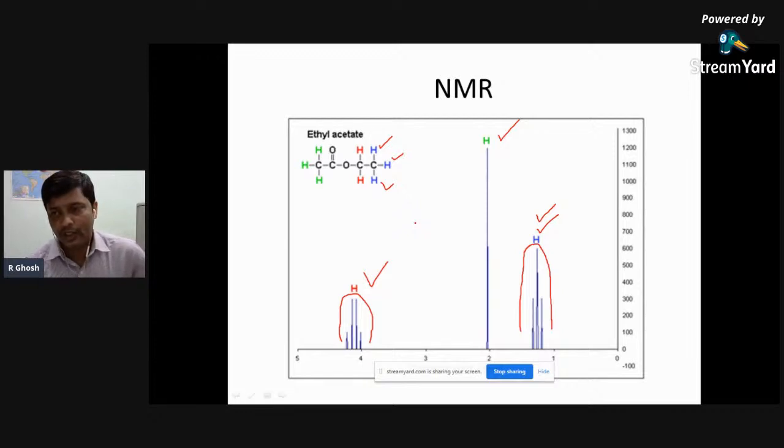And for purification, crystallization is another method. But if it is a mixture of components, it is tough to do crystallization for purification. It is possible for synthetic chemistry people to use crystallization for purification. But for natural product chemistry people, we can utilize column flash chromatography for all those types of purification methods. Once we have been able to isolate all the molecules one by one, you can check which particular component has shown promising antibacterial activity, and target that molecule and characterize it with the help of analytical tools.